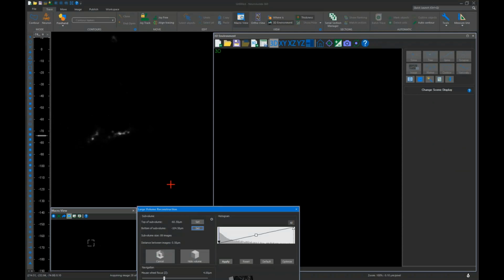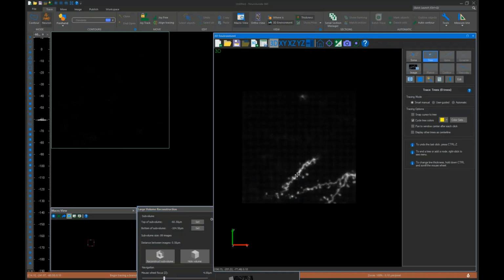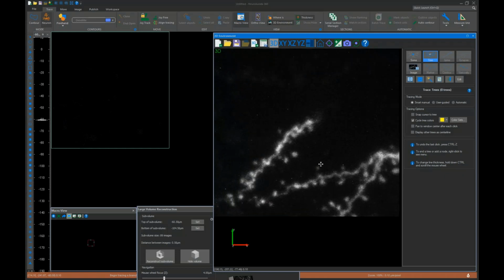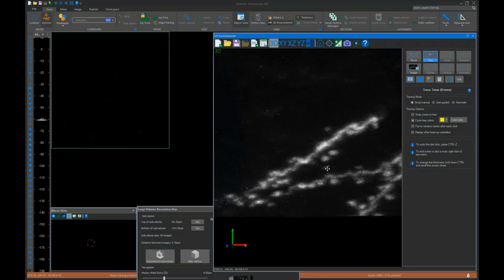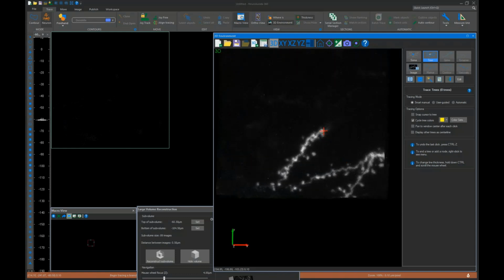Luis is asking if we have to reconstruct the trees before detecting spines or varicosities. Yes, you always have to have a tree structure before you can detect spines or varicosities. And it does not change any detections that were previously done. So if you have worked in, let's say, the apical area of your dendritic tree and detected spines, because we have by default the keep existing spines checkbox selected, you're not going to overwrite that with this new detection.